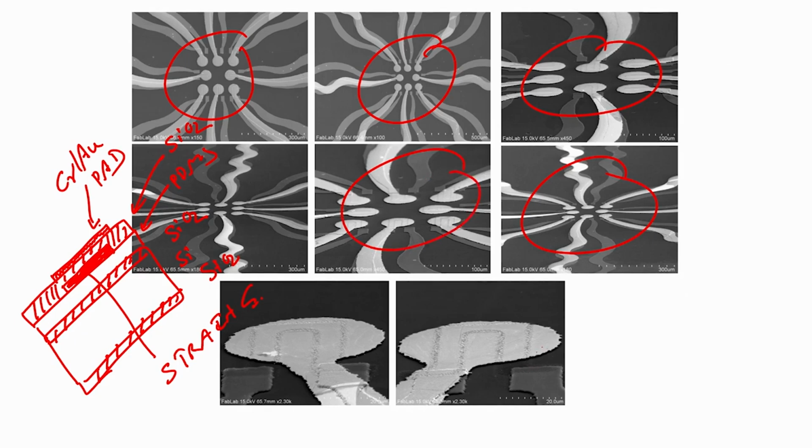Single pad, you can very clearly see in this image there is a strain gauge, and then there is an insulator over which there is a gold pad. What is the size? So, 20 micron is this size, the bar line shows 20 micron. So, it is about 50 micrometer diameter. Okay. Clearly see the SEM image of a gold pad on insulator on strain gauge.